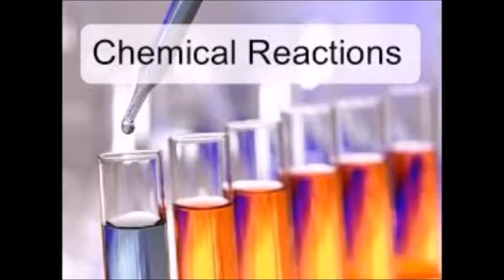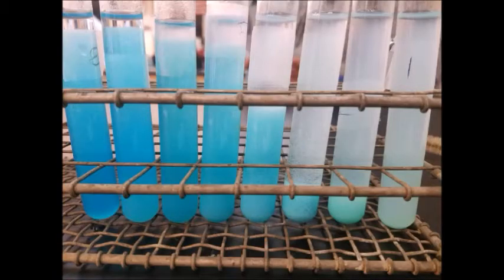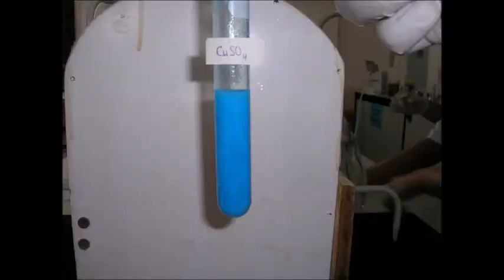The chemical reaction created a blue hue precipitate varying in the color blue. In test tubes 5 through 8, the tubes were filled completely with the precipitate. The precipitate created was copper(II) hydroxide, also a hydroxide ion. The heights of the precipitates, measured using the metric ruler, were used to determine the limiting reactants.